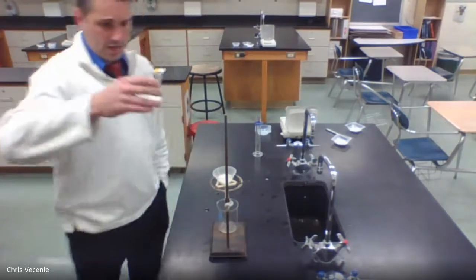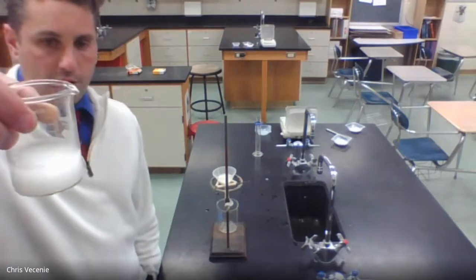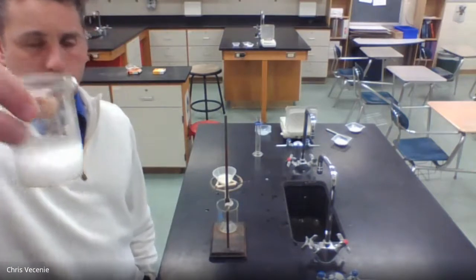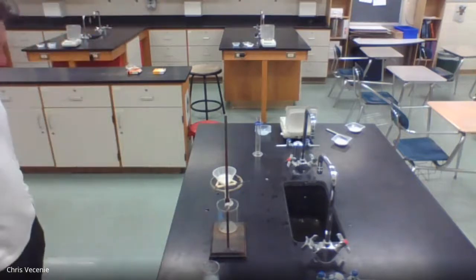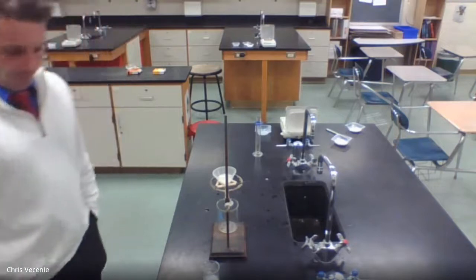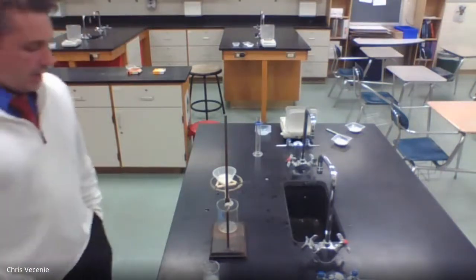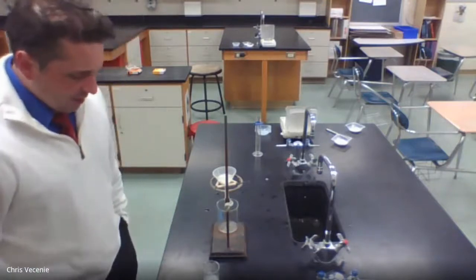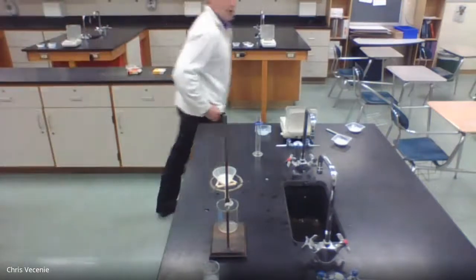So we'll pour it and see we're doing good. We had about 60 milliliters in here to start, and we're already under the 40 mark. It just takes a little bit of time for that substance to drip through. So I'll be filtering for a minute. Now grab a cup of coffee while you guys work on those problems. And as soon as it's done filtering, we'll get that guy in the oven.